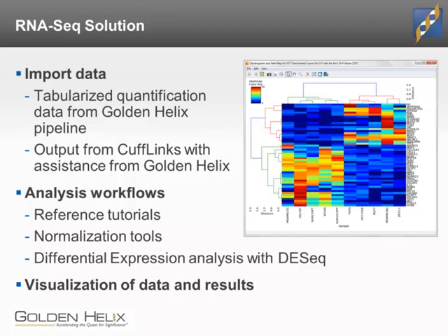After import, SVS contains methods for analyzing your data, including principal component analysis, numeric association tests, numeric regression, and the DESeq algorithm. Once the data has been analyzed, the results can be viewed in a Manhattan plot, a heat map with dendrograms, and in Genome Browse, which supports BAM and annotation track visualization.